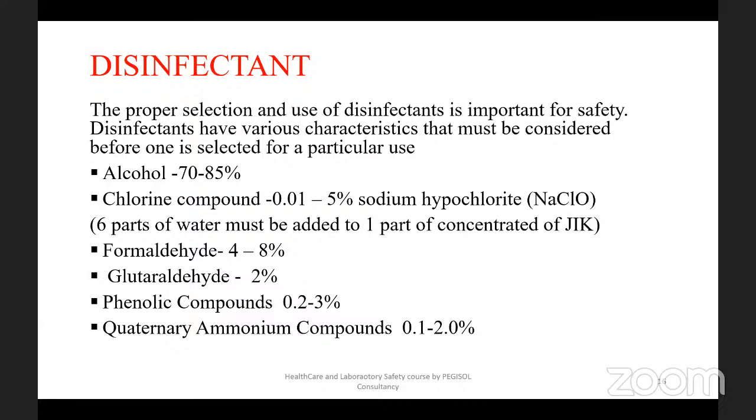Now we have alcohol from 70 to 85%, chlorine compounds, formaldehyde, glutaraldehyde, phenolic compounds, and quaternary ammonium compounds that have different compositions, hypochlorite, stuff like that. So whatever you're using, you should be able to address your safety need.